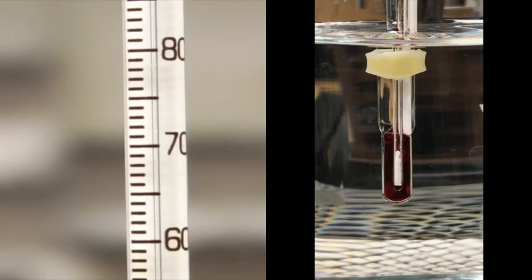Alright, the water's already up to about 33 degrees. And we can see that there's no melting yet.